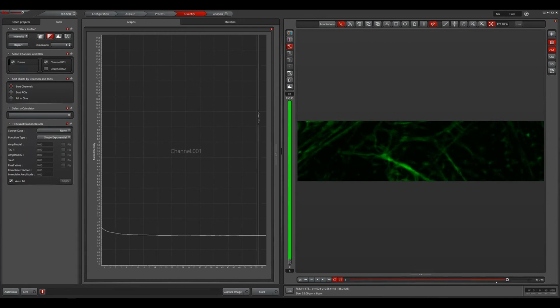So I hope this shows you the benefits of Tau STED, that we really can image, especially in live sample situations, much more gently than what was possible before with gated STED. And we can still achieve a high resolution and high contrast with this method without having to introduce a lot of light into our sample or to do a lot of repetitions or slow scanning.